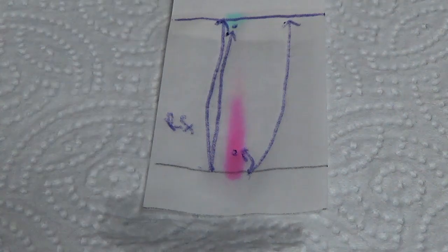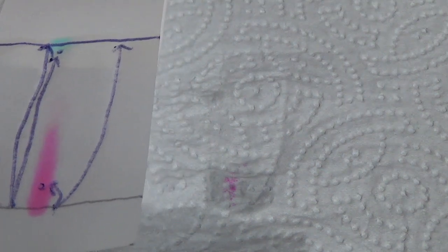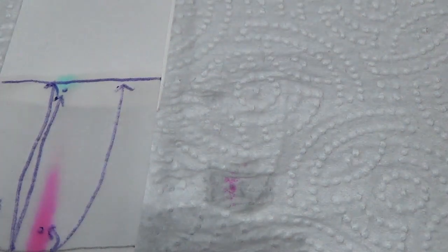Earlier, I did paper chromatography for green food color, and you're like, well, if purple is red and blue mixed together, which kind of makes sense, green should be blue and yellow. Well, here is my green food color. It moved all the way up. And what I want to point out is this is actually, in this particular case, FD&C Green number 3. That is what you know of as green food color.